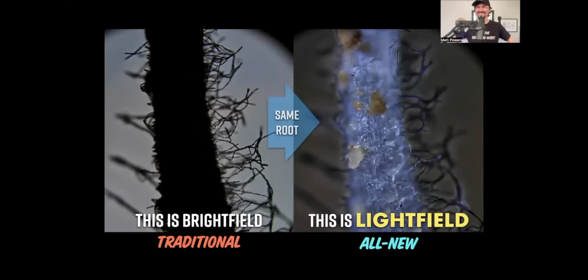Let's go. And so I got past Brightfield, quite literally, and created manual lighting. At first, I called it Lightfield and figured out that Lightfield was something else that they had already used the name for. So I changed to manual lighting to be even clearer as to what it is, right? But there is a special angle. I was doing it by hand, manually. My students are so smart.